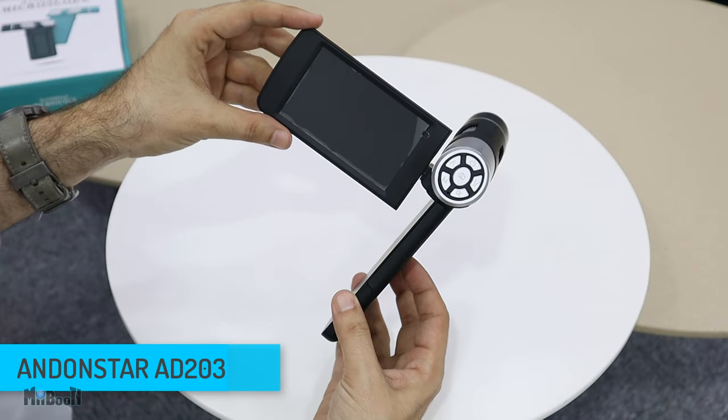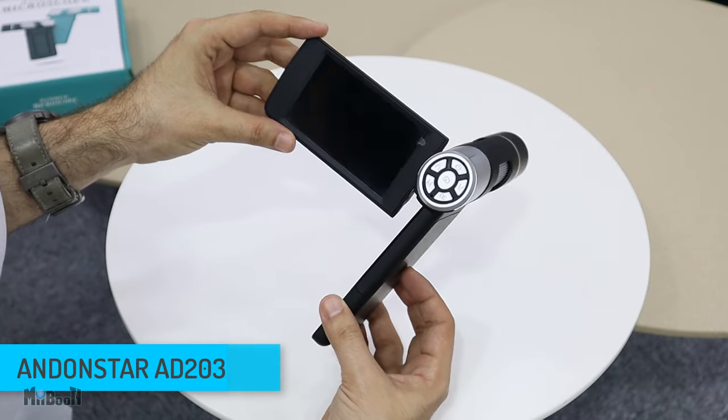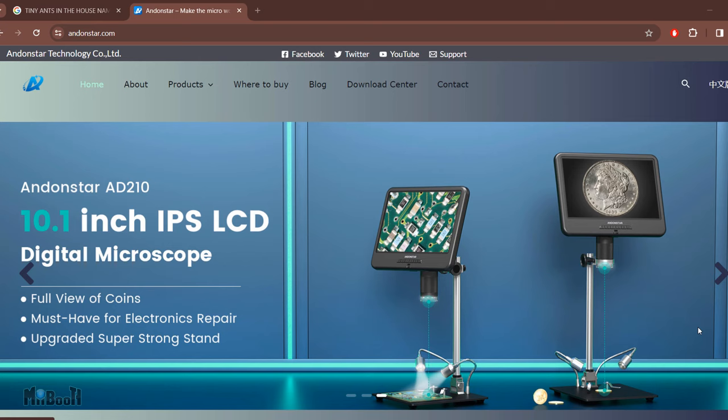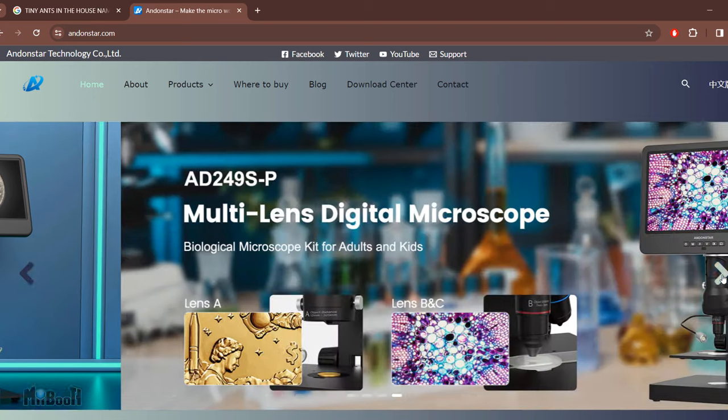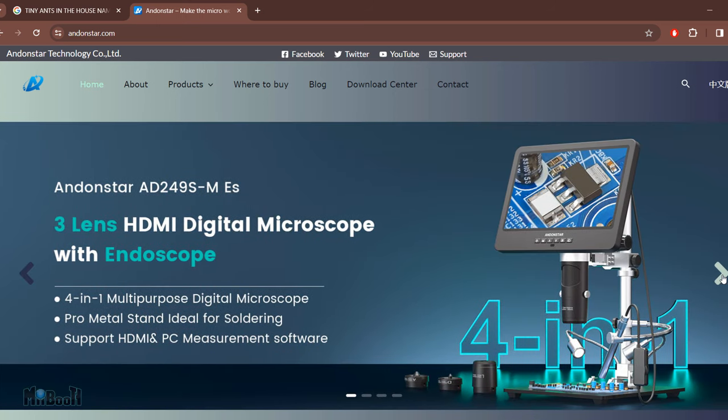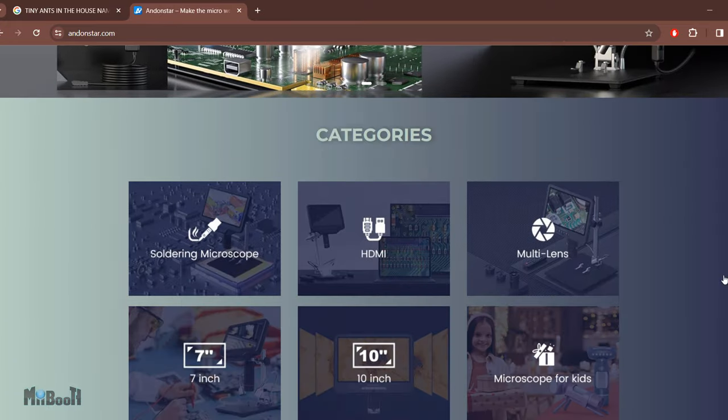This is the Andonstar point-and-shoot digital microscope. It has a technical model name of AD203, but end of the day it's a point-and-shoot digital microscope. Let me give you some backstory. It might come off looking like a cheap scam gimmick toy from one of those shady ads on channels like 5-Minute Hacks or Blossom, but trust me it is nothing like that. Andonstar has been making quite good quality digital microscopes for a couple of years now, mainly for soldering, but being a digital microscope it can't help but serve multiple purposes.